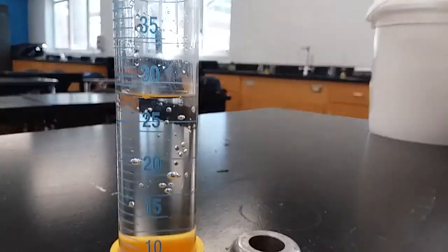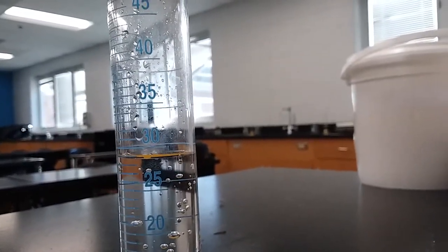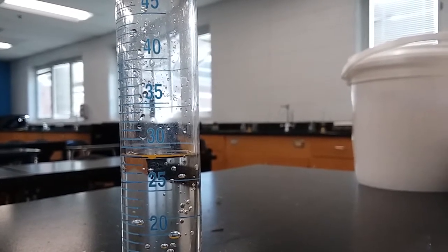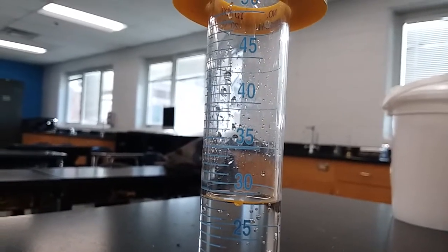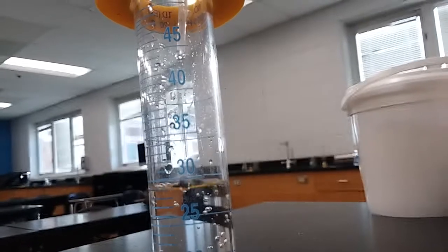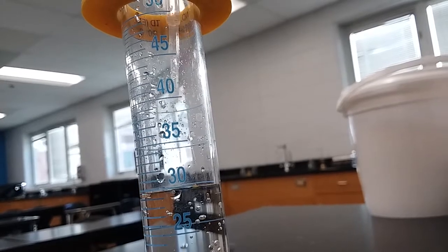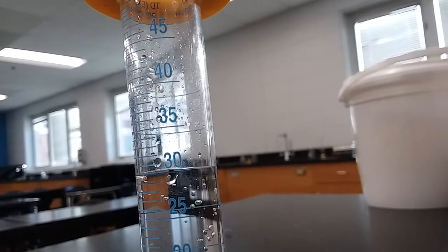Next, I'm going to measure the volume. So over here, I have a graduated cylinder, and let's say that I wanted to get 30 milliliters of water in there. I'm not at 30 milliliters now. I'm just a little bit below. So let's get that meniscus to be right under. There we go.